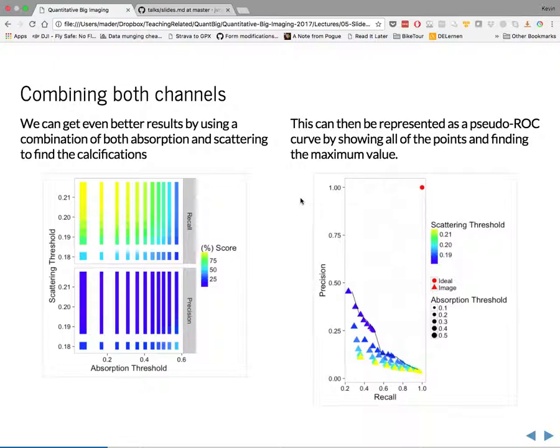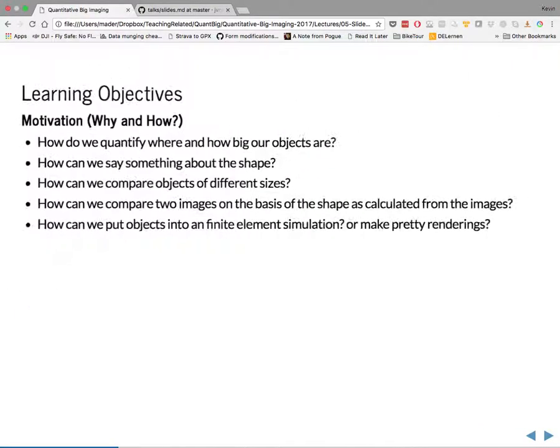Obviously, if we have a very bad segmentation, then no amount of tweaking with the single component analysis, as we call it, will improve that result. But we can't focus anymore just on the single pixels. We start having to look at the bigger picture, and so groups of pixels and the analysis that we can get out of these groups of pixels.